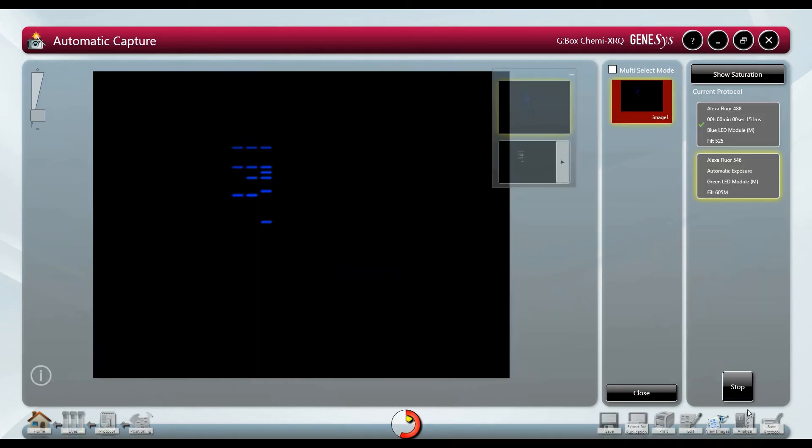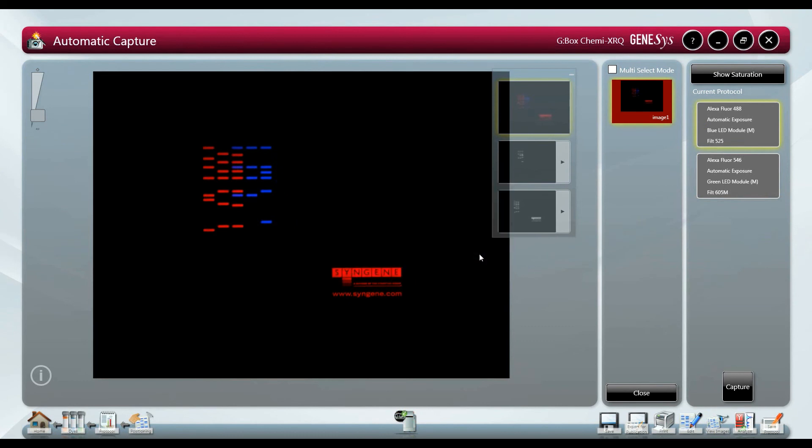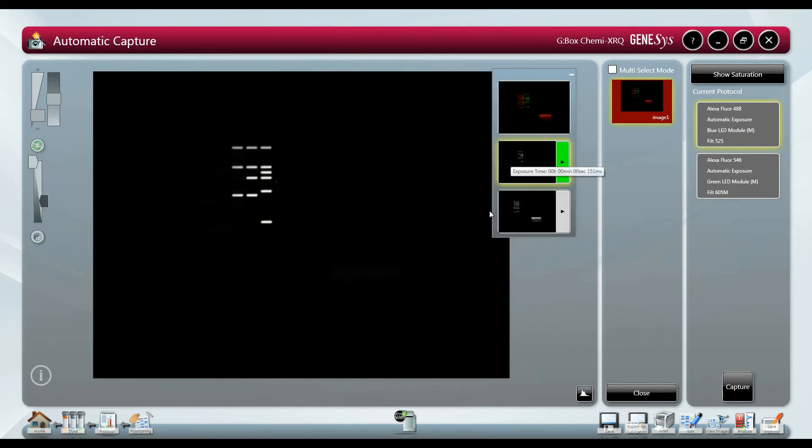As with all automated capture images in Genesis none of the pixels will be saturated by the sample which is ideal for quantification. The protocol can be saved to the home screen to save time when setting up future samples.